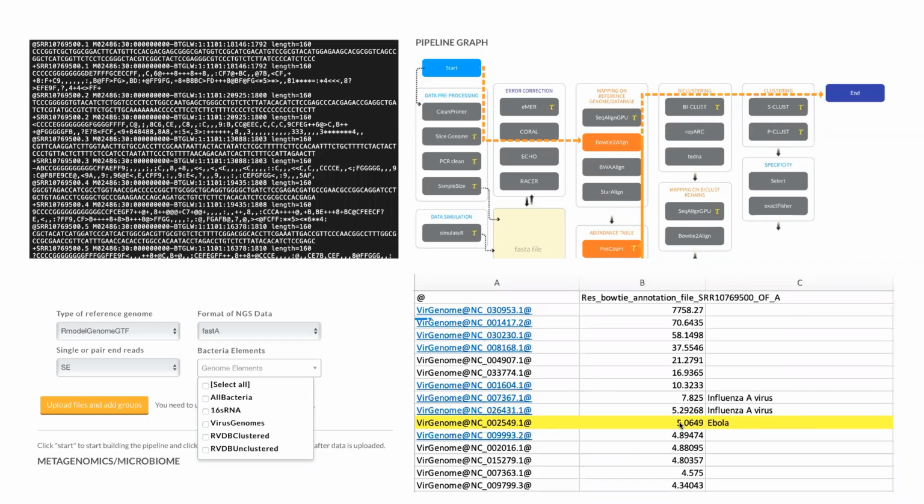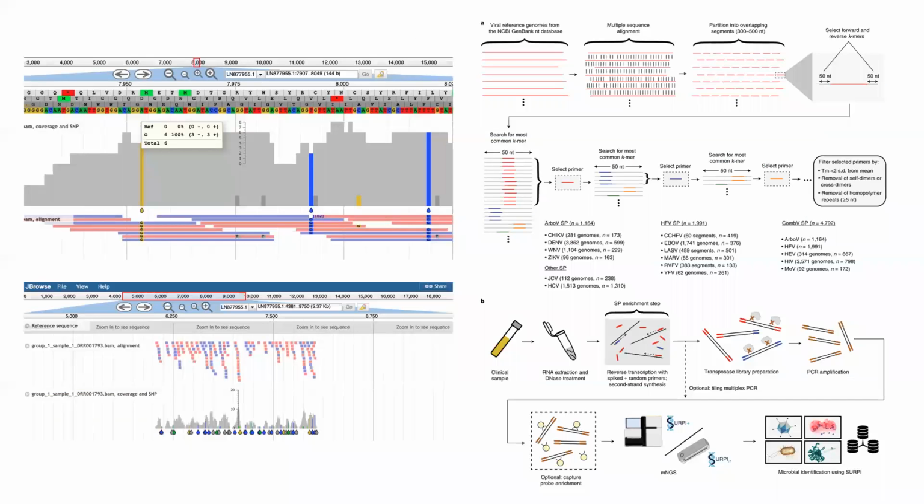And so then we ran a second pipeline, and that second pipeline took the reads that we identified that fall onto that reference genome, and we actually produced a visualization. And that visualization looked like this, where we saw that there are reads that aligned in a certain position on this Ebola virus genome. And that is kind of where we ended, right?